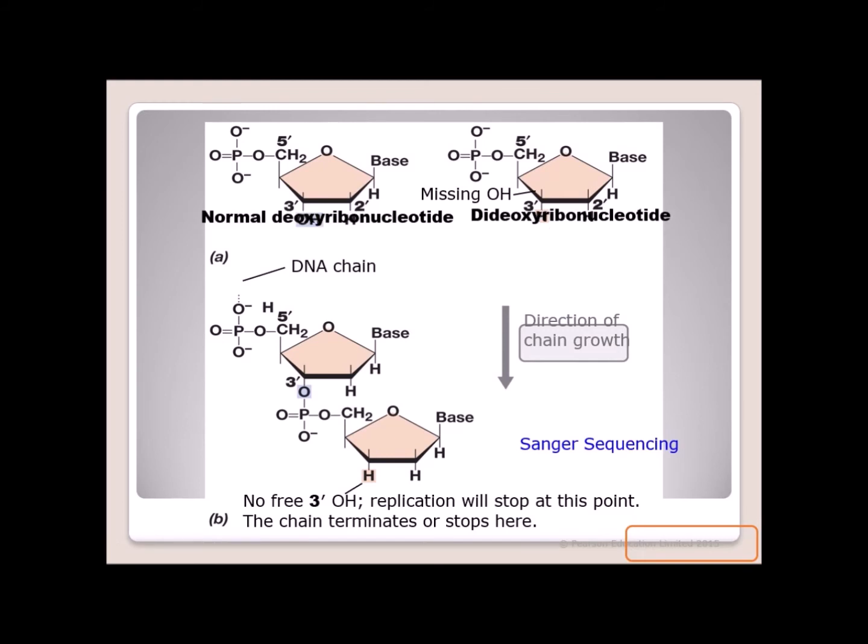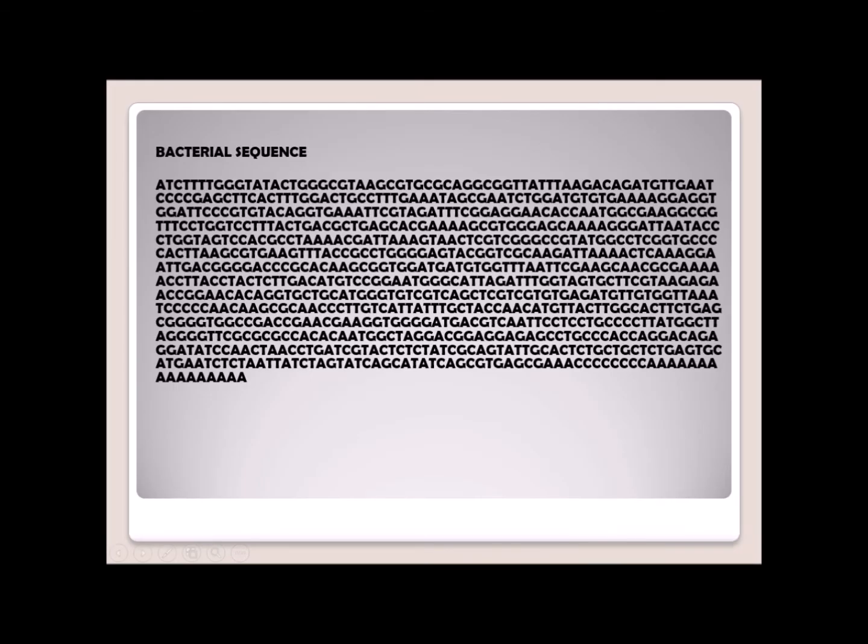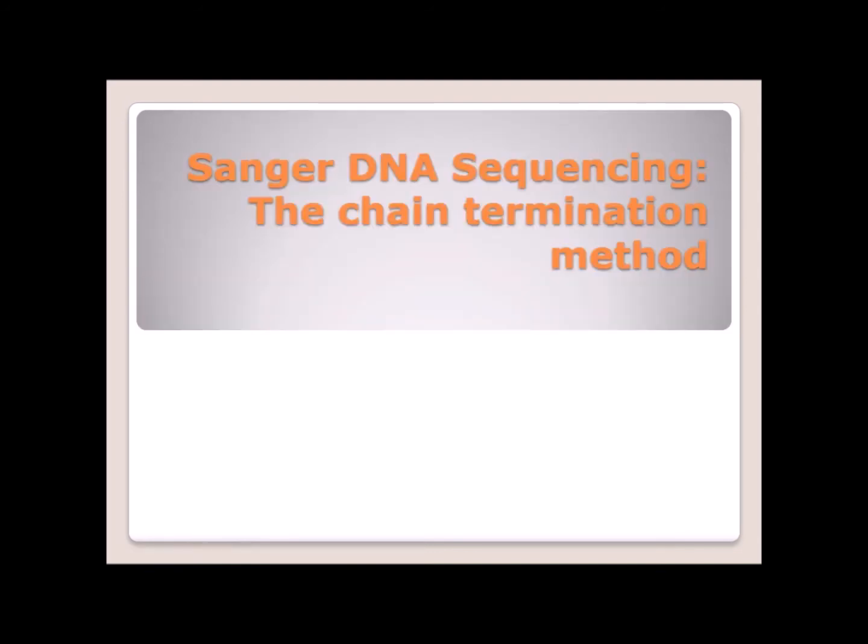So sequencing stops. Then after the sequencing, you arrange all the sequences you have obtained. Then we get the name or the identity of the organism using a database, such as BLAST, the NCBI tool, and there are other databases that you can use, but the NCBI seems to be the most acceptable.